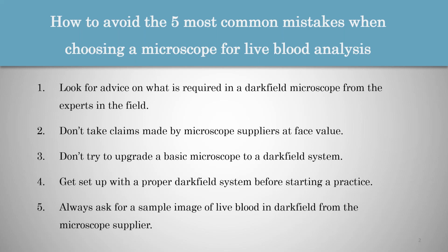Right, and then the fourth point, it is also advisable to get set up with a proper darkfield system before starting a practice. So some attendees, because of the cost of a proper darkfield system, feel that they would rather build up a practice with a basic microscope just to get started, and then once the practice is busy enough, it would justify the expense of a professional system.